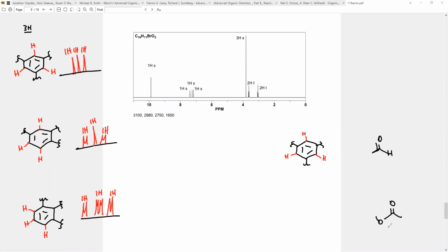We could put an oxygen. That's a 0 hydrogen structure. We can put a carbonyl. That's a 0 hydrogen structure. Just spitballing really, right? We could put a tert-butyl. There's so many things that we could put next to a proton so that it has 0 neighbors.